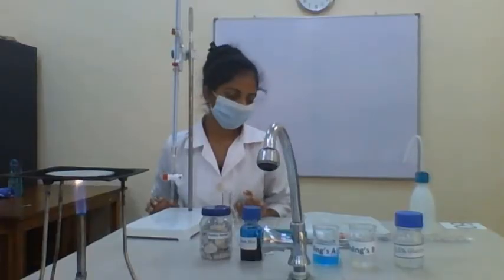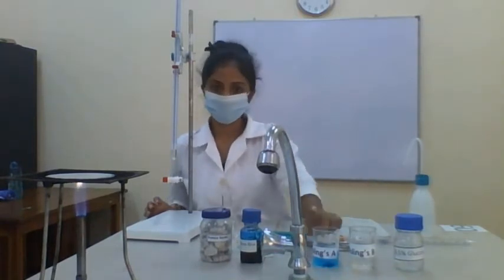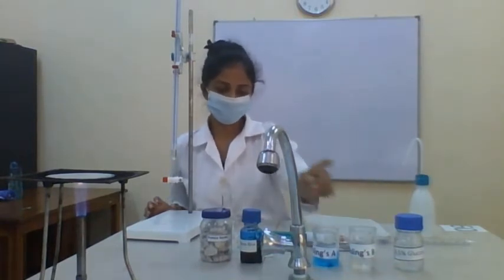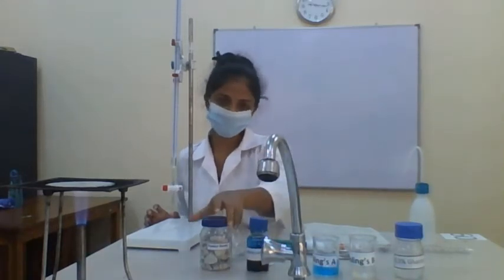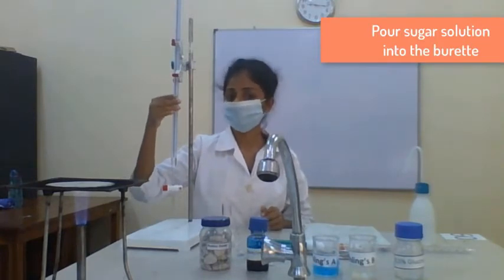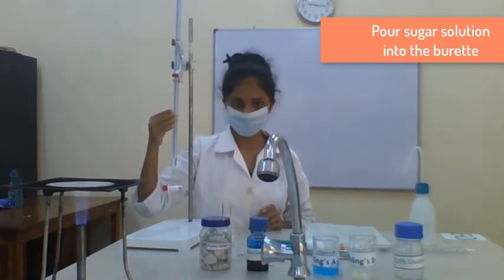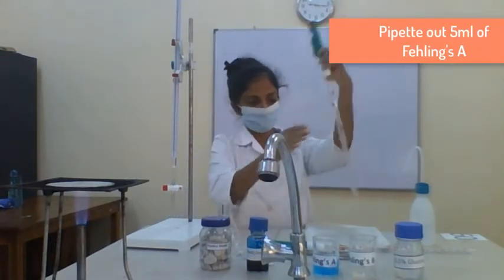Today's practical is glucose estimation. For this practical, we need Fehling A and Fehling B solution, methylene blue indicator, and pumice stones. First of all, we have to pour the sugar solution into the burette. Then we need to pipette out Fehling A solution.